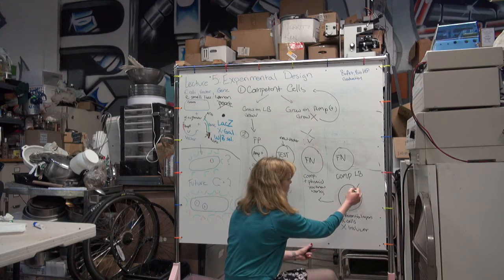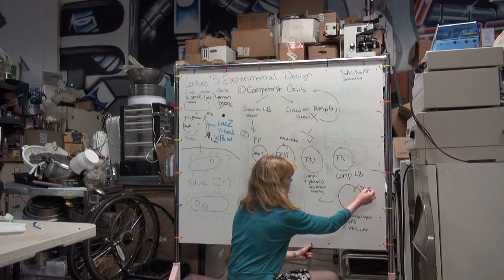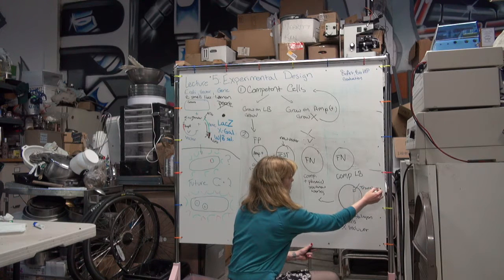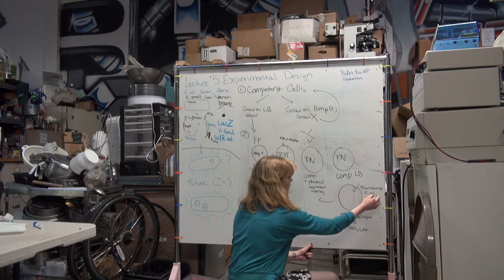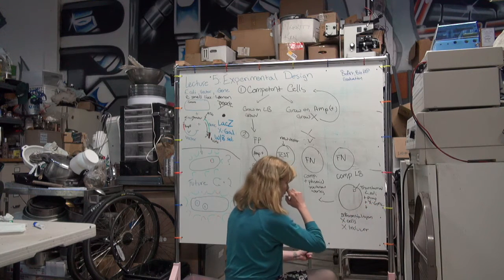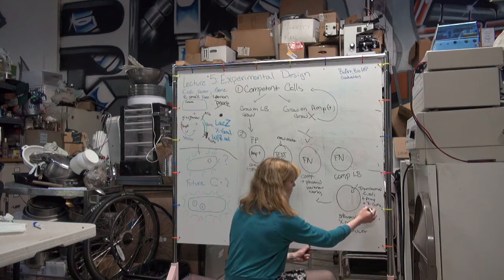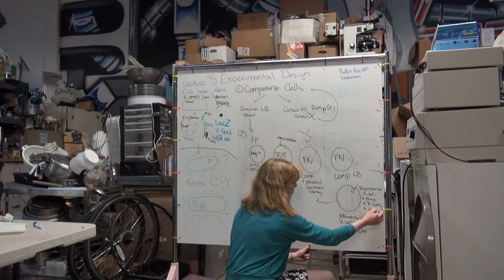So this plate is going to be, again, pre-transformed E. coli, right? That is positive for ampicillin, positive for our case X-gal, as X-gal on the plate, right? And also work with that. And if there's an inducer to turn on the gene that we're looking for, there's inducer and reporter.